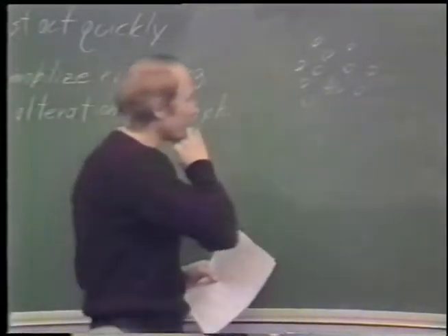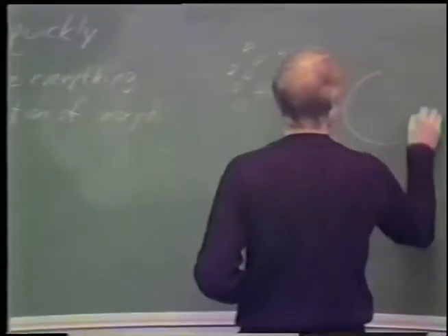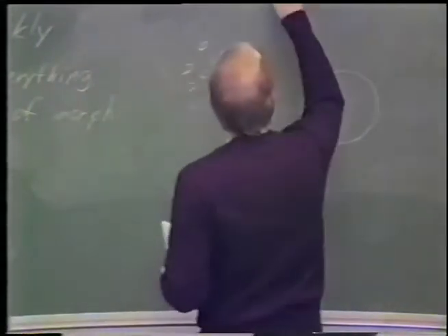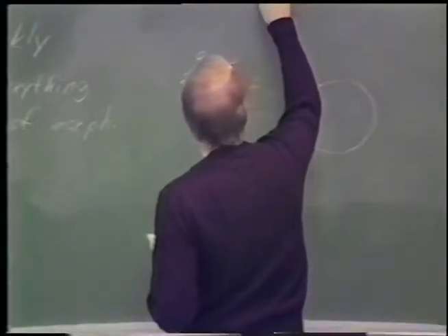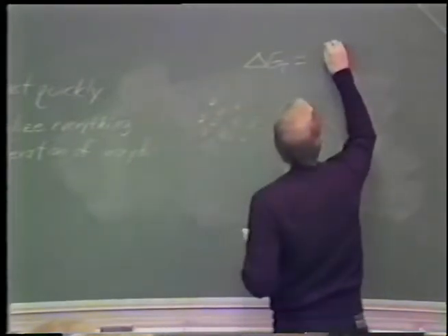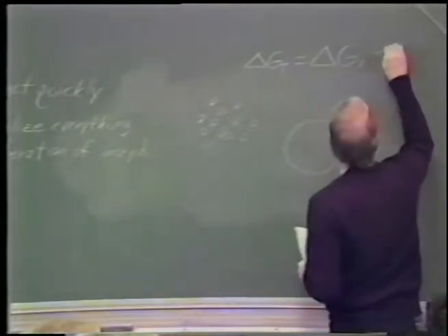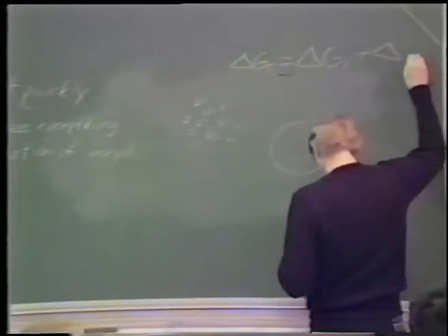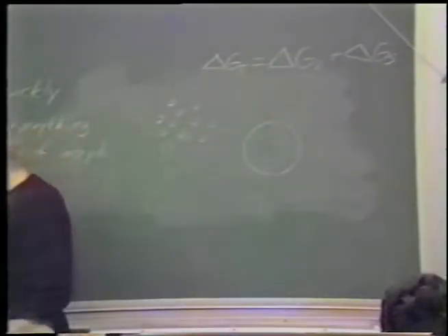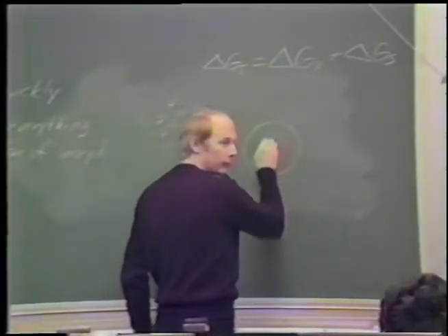Now, in the formation of such a cluster, one can describe the free energy of formation of this cluster in terms of two factors. Total free energy of formation is equal to the volume free energy, as it's called, plus surface free energy. The volume free energy of the cluster is contributed by those water molecules in the interior.